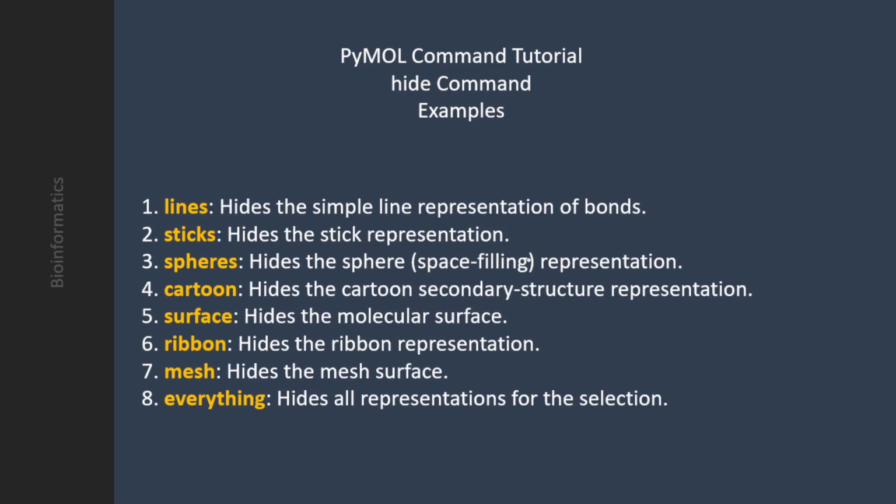So the command remains very simple. As you can see over here, you have different ways to hide representations. You can hide the simple line representation. You can hide the stick representation. You can hide the sphere representation. Then you have cartoon representation, surface representation, ribbon representation, mesh.